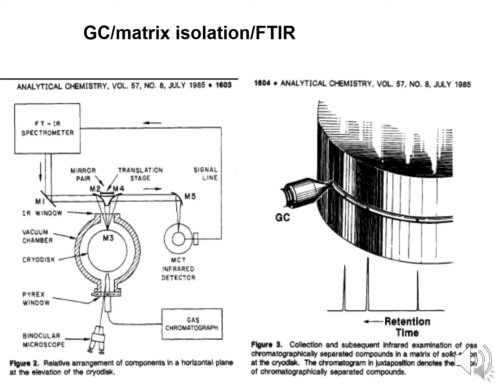This picture on the right is a gold-plated carousel which was rotating with time. The GC track is being laid down. That's a track of the argon. We add about 2 to 3% argon to the carrier gas. You put the effluent from the GC column very, very close to the surface, the helium gas gets pumped away, and we end up having this nice track of argon being laid down, which comes off like a very nice amorphous blob, kind of like liquid cement being laid down.